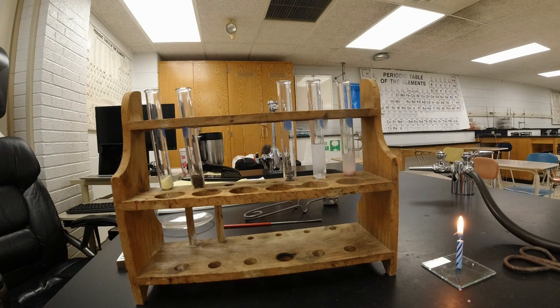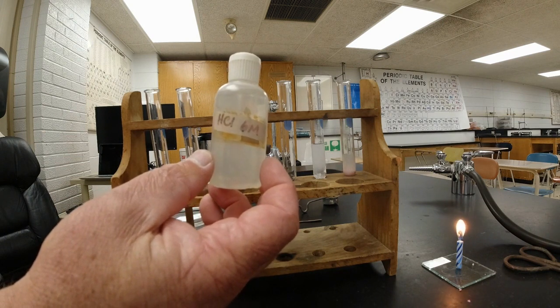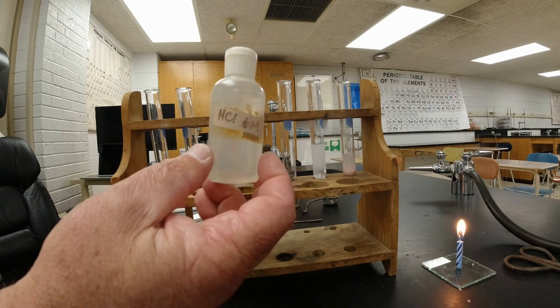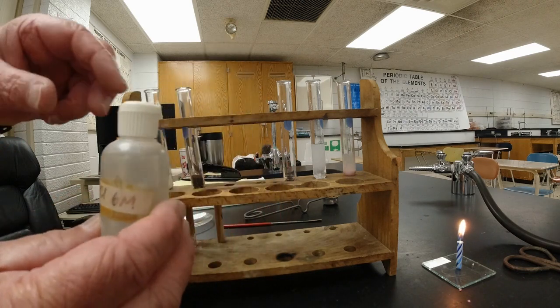Now, hydrochloric acid is measured by its strength by something called molarity. We'll learn more about what that molarity means. But the bottle on this one says HCl 6M. The 6M stands for molarity. Most of the acid, the stomach acid, for example, is a 1 molar acid. Most of the acids that we use are 1 molar, so it's not terribly dangerous. This is actually pretty strong acid.